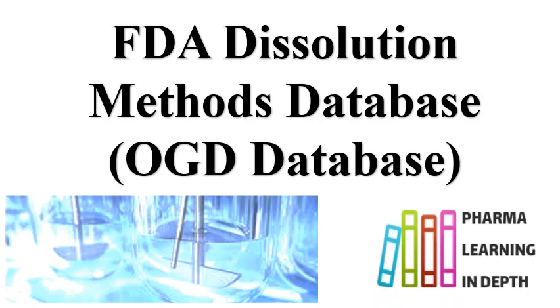Whenever we are working on a pharmaceutical product, we require a starting point for the dissolution method development. We can do a literature search and find out the dissolution method used for the particular product. We can go through the monographs in the pharmacopoeias, search the literature, check the journals, and also check the methods generally adopted for dissolution testing.